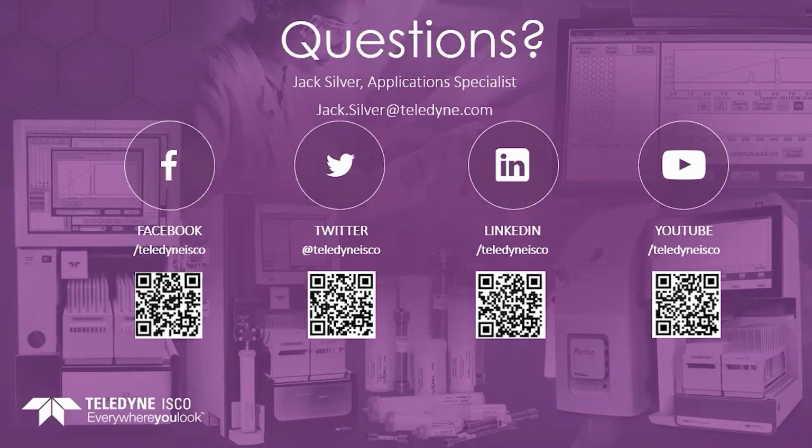Okay, to go back to the earlier question, you go into configuration, prep HPLC, hit define methods, and there's a new scouting method button in there, and that sets up the gradient. The reason why we have it as a button is because it is a special method where you cannot change very much.